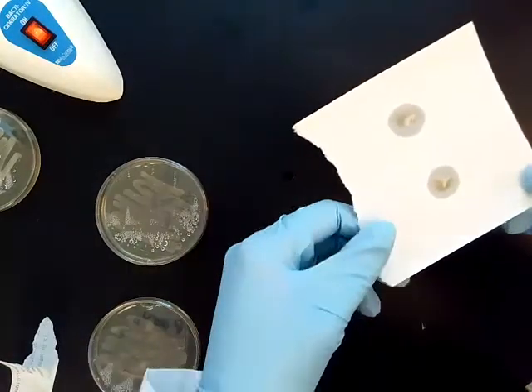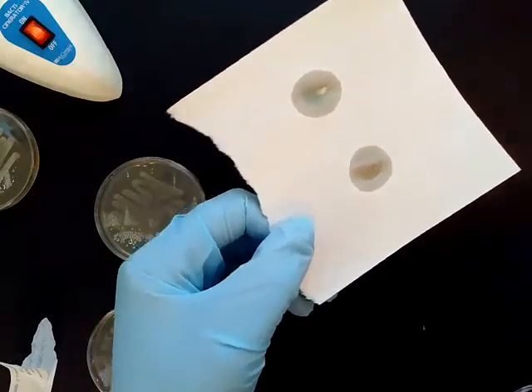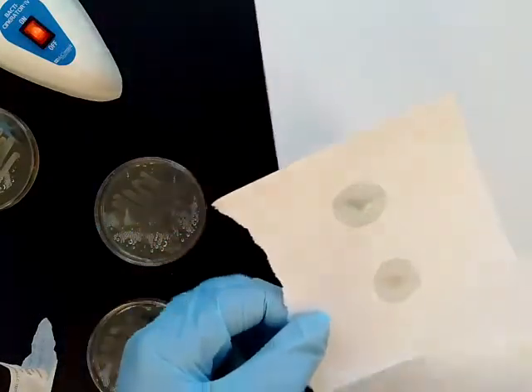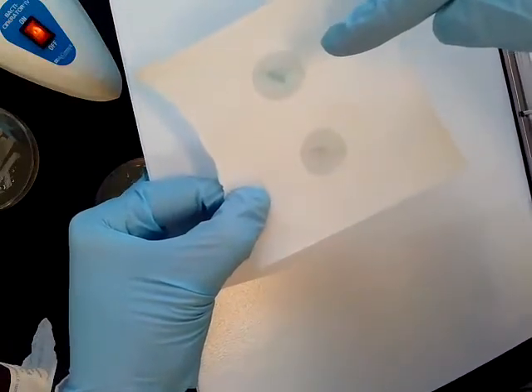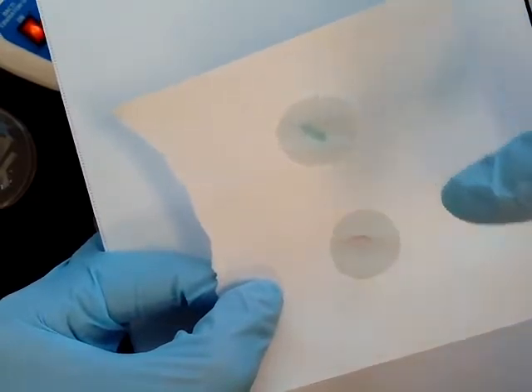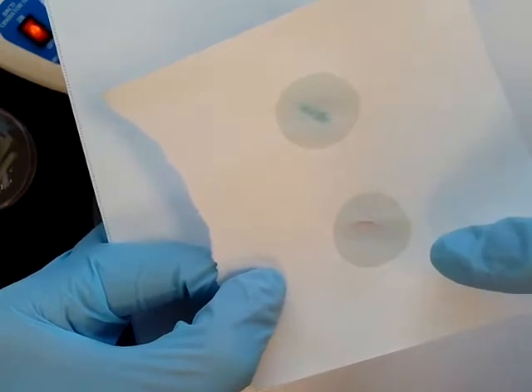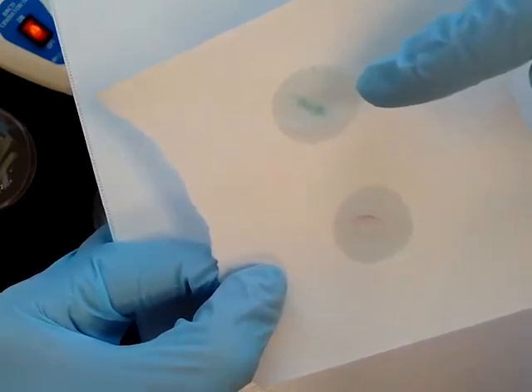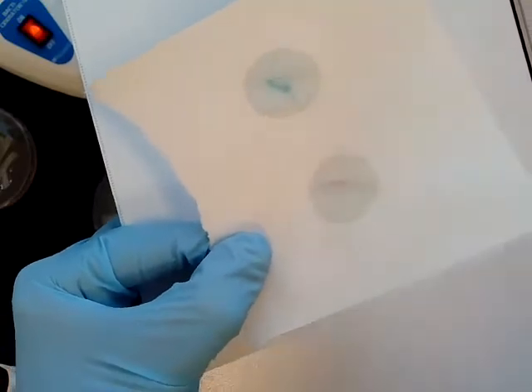And it may be difficult to see at first, so you might have to put it behind a white background. So I'm going to grab a white background here. You can see the top one has turned like an aqua blue color. This one is a positive result. The bottom one is a pink color, so that is a negative result. So positive for indole production from tryptophan degradation, and negative.